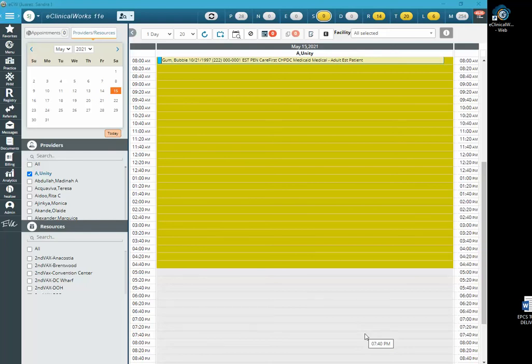In these short videos, I will be demonstrating how to process various lab orders. We will be learning how to process same day order, also known as current. We'll be learning how to process a future order, also known as a lab only visit, as well as the situation. And we will also learn how to reconcile expired orders.